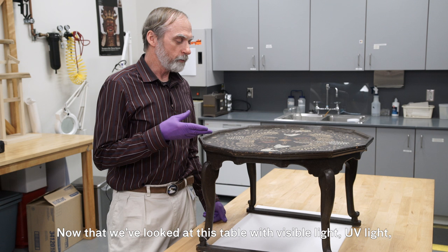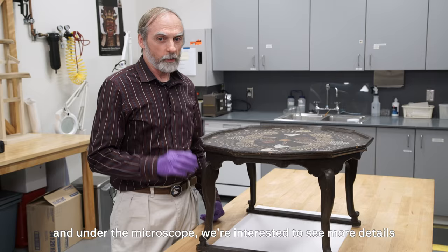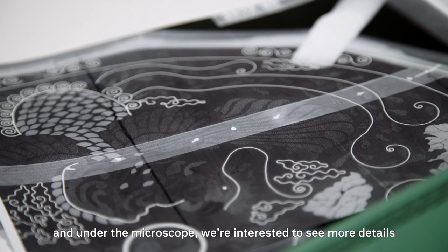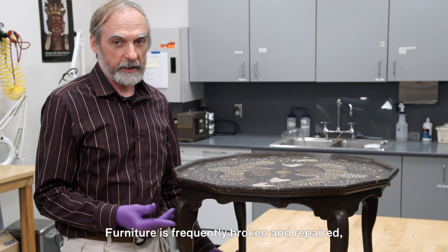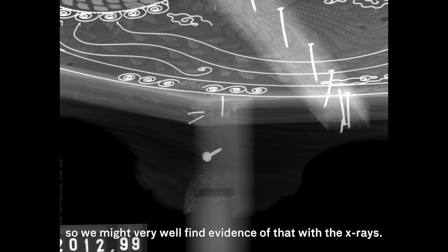This means possibly a repair campaign along this crack. Now that we've looked at this table with visible light, UV light, and under the microscope, we're interested to see more details about how it was constructed, and for that we're going to use x-rays. Furniture is frequently broken and repaired, so we might very well find evidence of that with the x-rays.